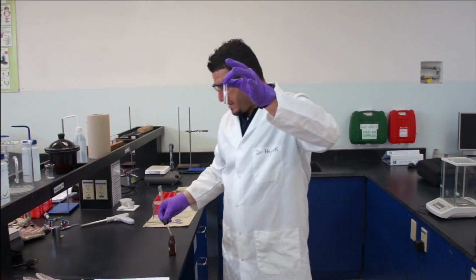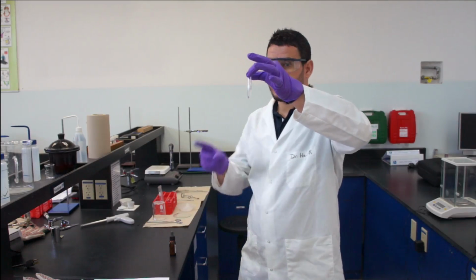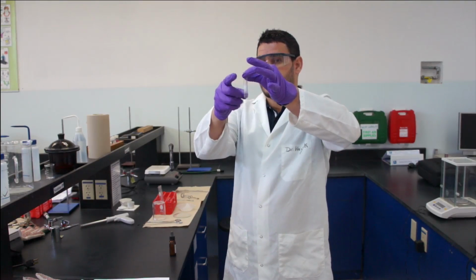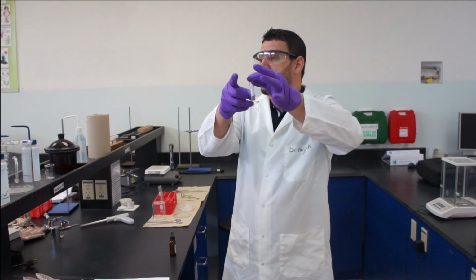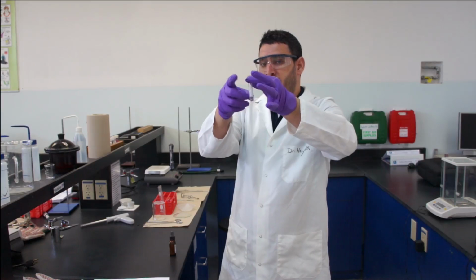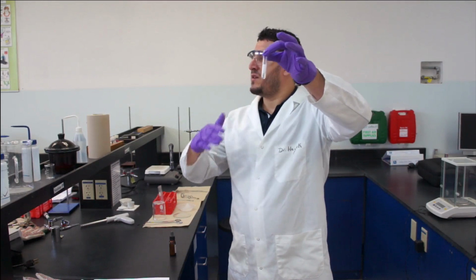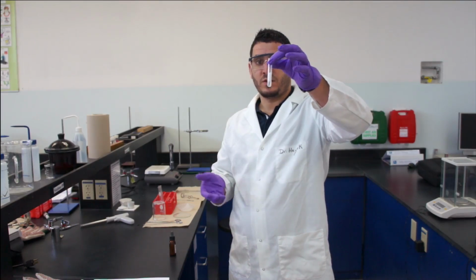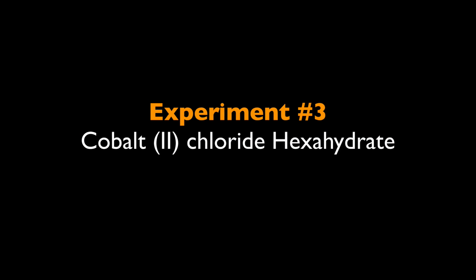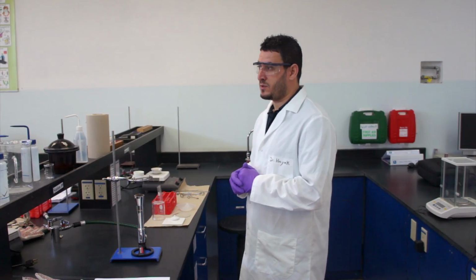So you can also see that I have white precipitate forming, which means that after dissolving sodium chloride in water and evaporating the water, it's still behaving the same way as when it was dissolved the first time. This is how the setup of your experiment 3 will look.